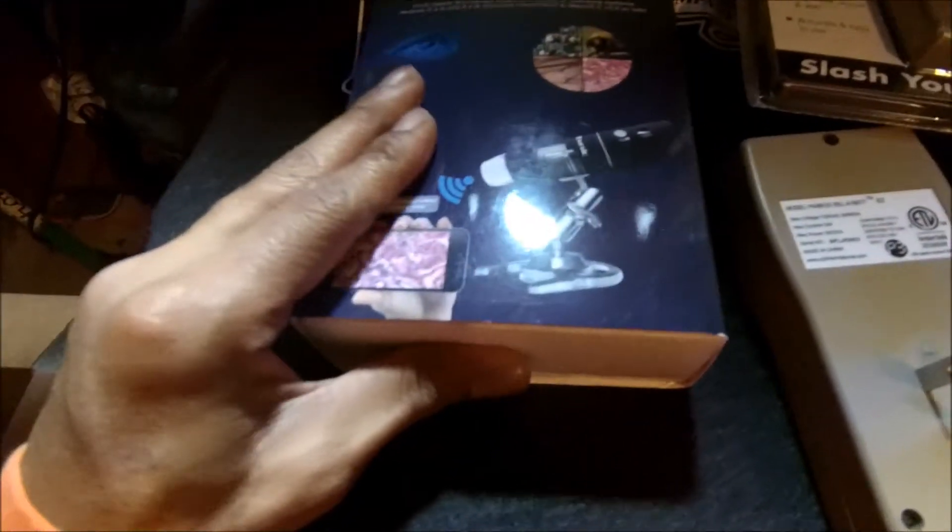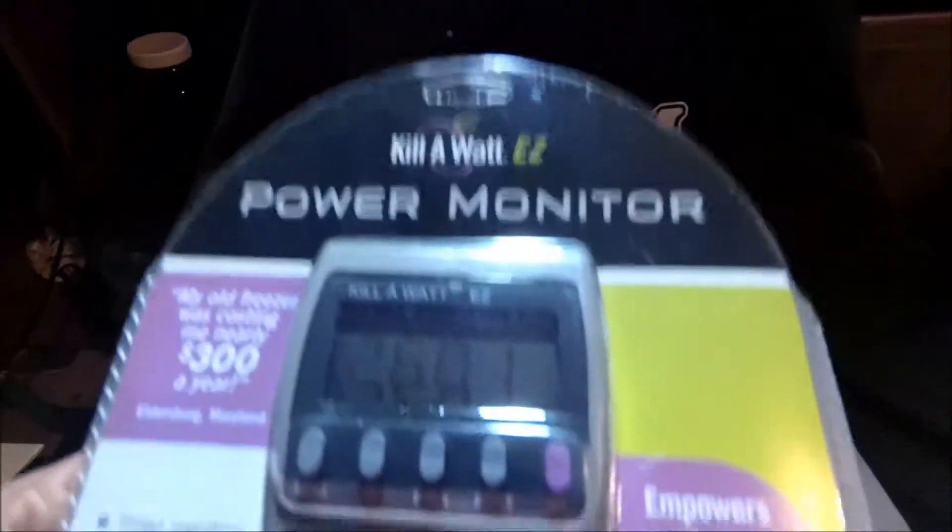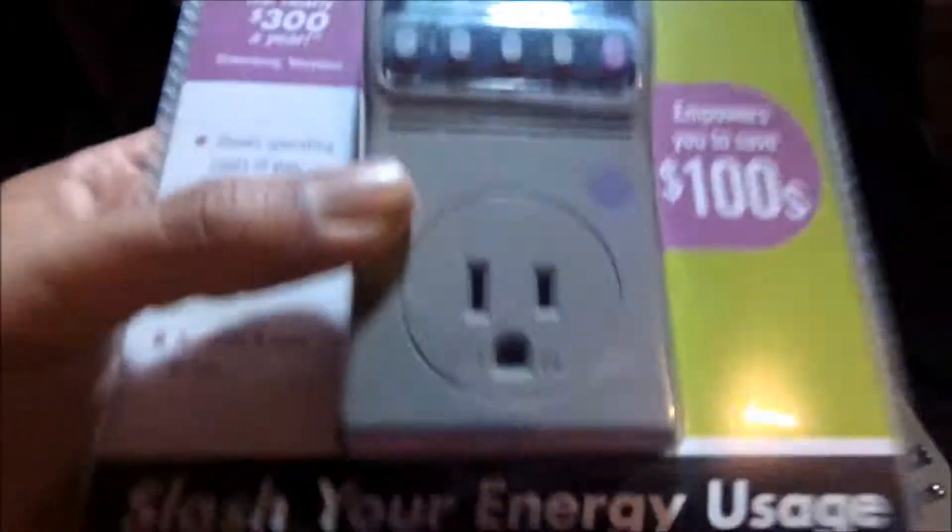But this is the main thing right here, my peeps — this is the main thing. I got a Sky Basic digital microscope. So this is the one I'm interested in. The kilowatt meter is just an extra one — might end up returning it. But it's cool, man, it really helps — very good tool to have.